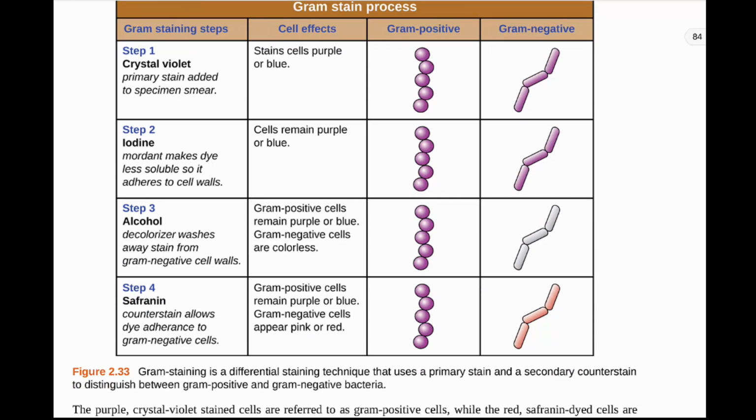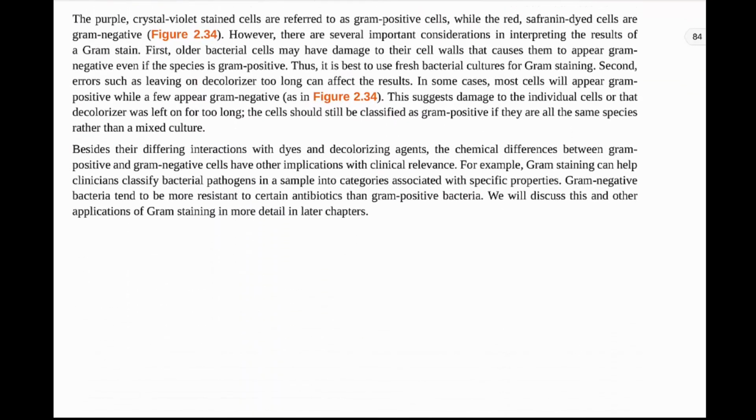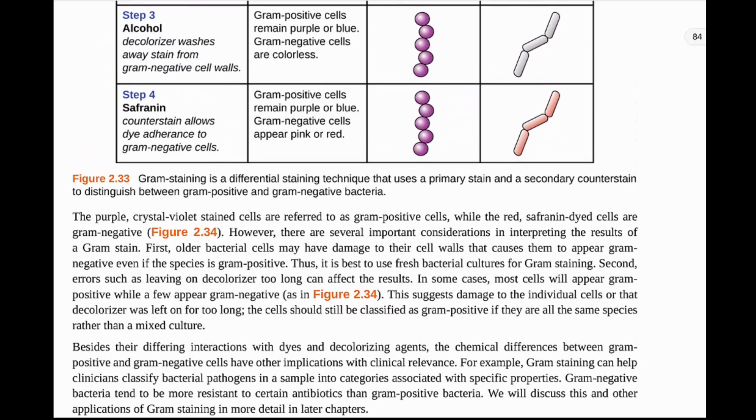Here we have this all laid out in a nice diagram. Step 1, step 2, step 3, step 4. If this is an easier way for you to visualize it, then that is fantastic. And then down here I'm going to finish talking about the gram stain and why we see what we see. So the purple, the crystal violet stained cells, are referred to as gram-positive cells. Okay, while the red safranin dyed cells are gram-negative. So when you're looking at a gram stain, those that stayed purple, the ones that had thick peptidoglycan wall, are called gram-positive, and the ones that have thin peptidoglycan wall are gram-negative.